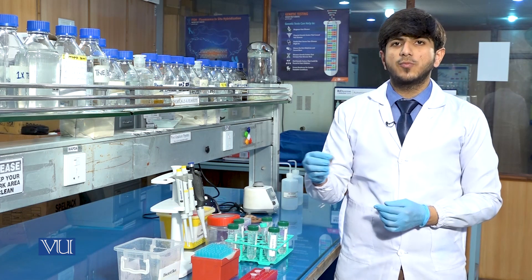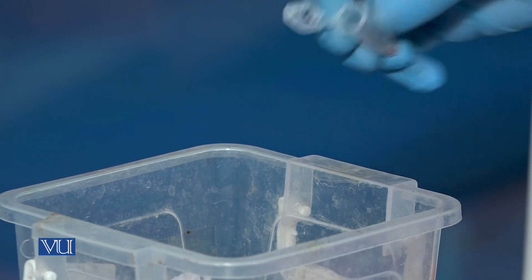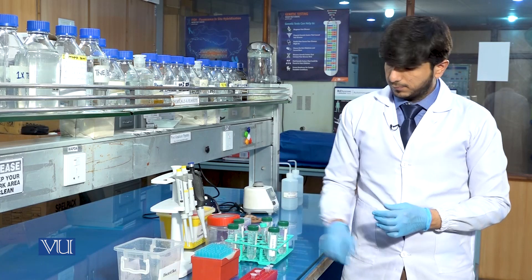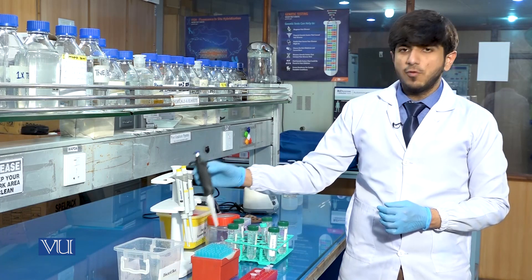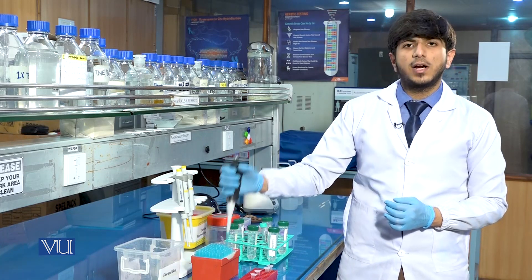We will discard the supernatant, preserving the pellet. Again, we will add 1000 microlitres of lysis buffer for the third washing.